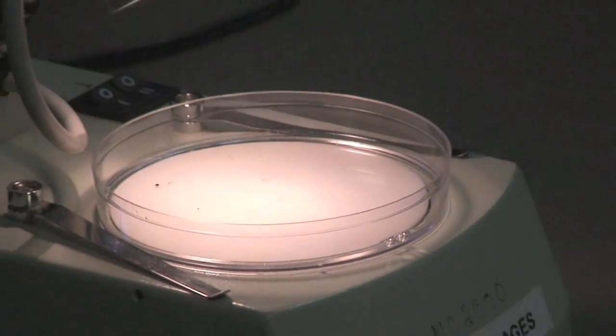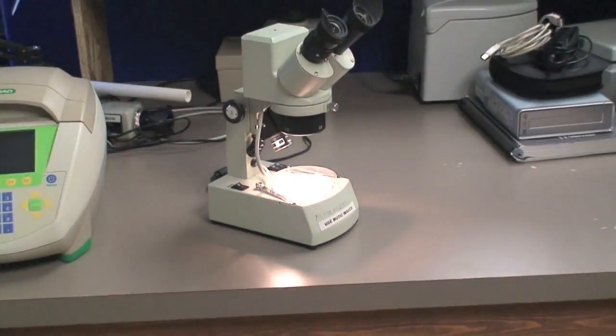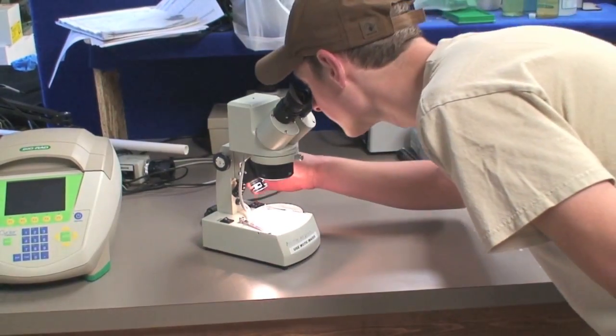After three days, remove the soil insects from the jar of ethyl alcohol and examine them underneath the microscope.